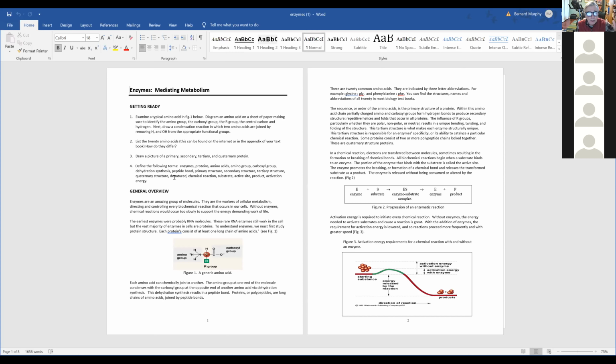And so we're going to do this experiment. We had 3 tables, and one table did it at 2 to 5 degrees in ice water. One table did it at room temperature, which was about 22 to 24 Celsius. And one table was a hot table, 60 to 70 degrees. So it heated up water on a hot plate. And enzymes will work at all those temperatures.